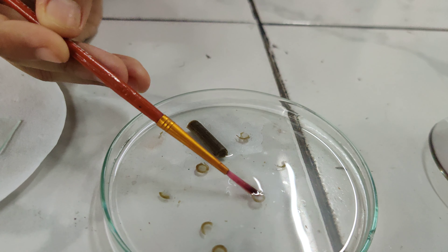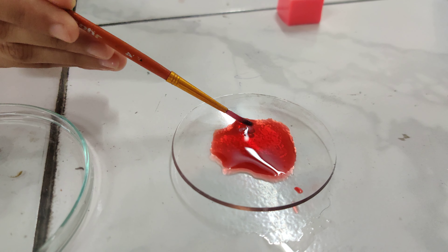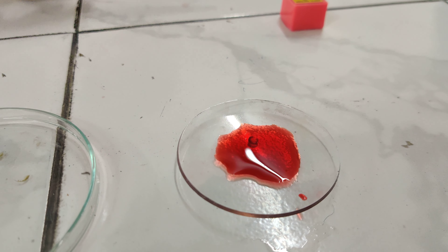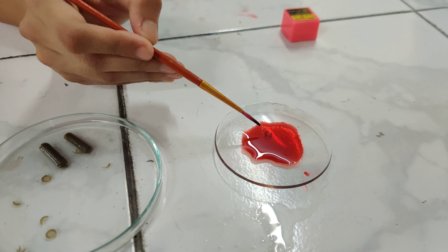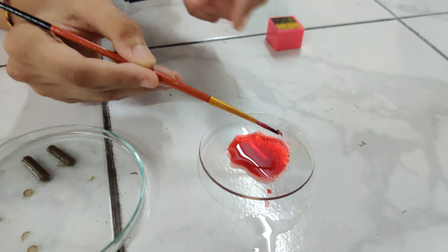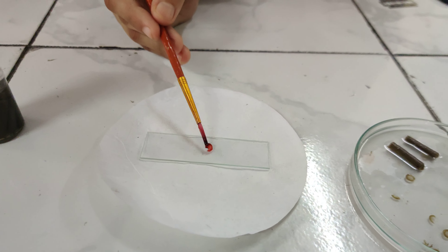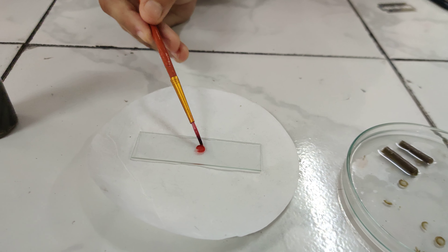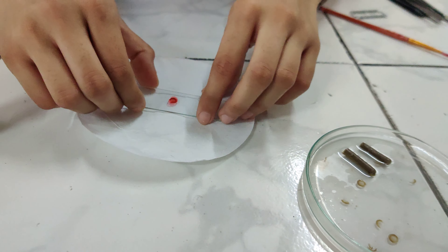Take out the thinner section with the help of a brush, transfer it into the safranin, and leave it for 2-3 minutes to stain the cells. Now take out the stained section and transfer it onto the plain slide at the middle. Remove the extra stain by wiping it with the help of filter paper.